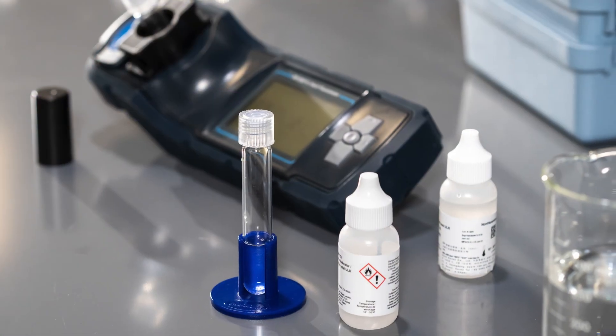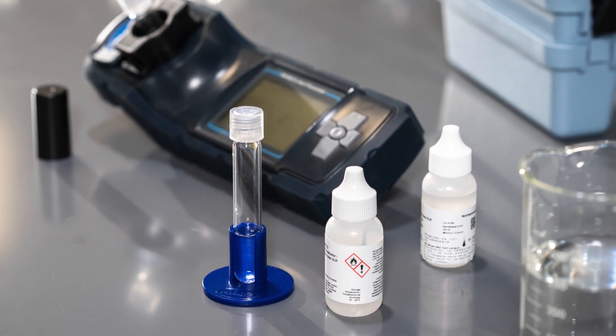In addition, with the DR1300FL and fluorescence tests, we have a few additional parameters that could be valuable to use in your facilities, such as sulfite, which can be important when talking about chemical dechlorination control and making sure those reverse osmosis membranes that you operate are happy and healthy.